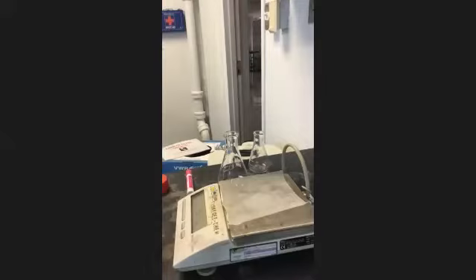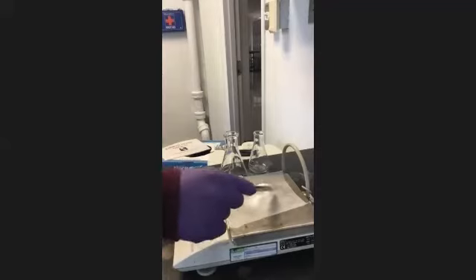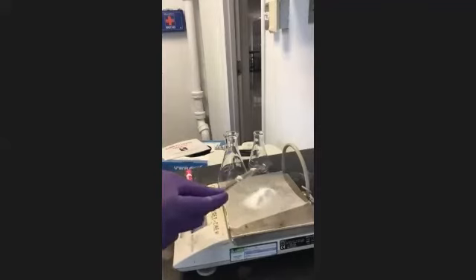So everybody who's zooming, remember we weighed out 6.91 grams. We don't use the same numbers you want us to have. They can be different. All right. I might be off on yours. It's all right. I'm good. We'll get close though.